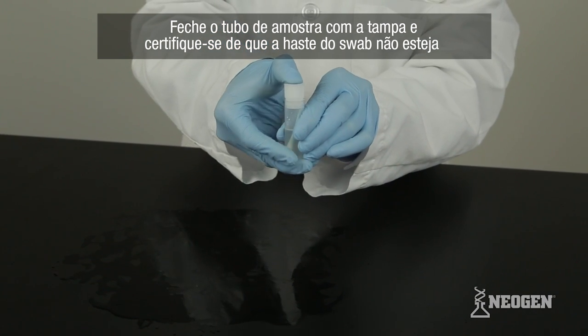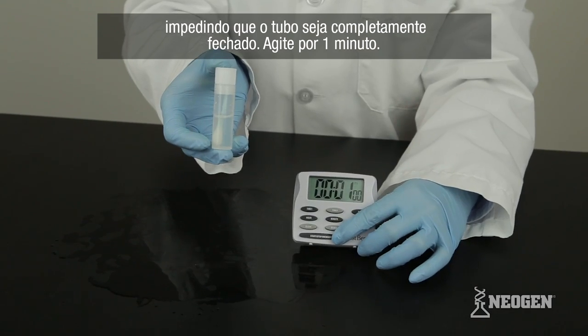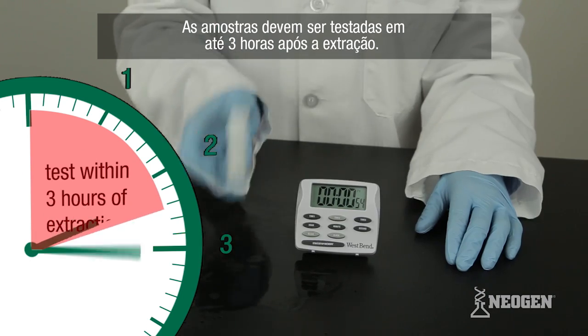Secure the sample tube's cap. Make sure that the stem does not prevent the tube from being properly sealed. Shake for one minute. Samples should be tested within three hours of extraction.